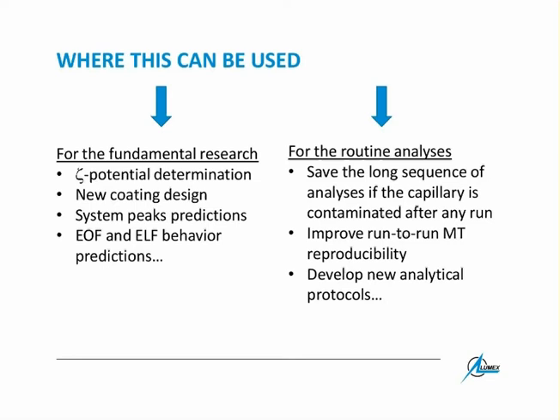It's a very long distance, to be honest, and you need about 30 or even 40 minutes to get the full separation of up to 200 kilodaltons of your protein, or at least 160 kilodaltons of IgG. But you get a very nice, very fine separation. Even small additives, small impurities can be resolved from the major peaks, because 23 centimeters is quite a long distance for such kind of separation. But it is for the price of a very long analysis time, up to 40 minutes.